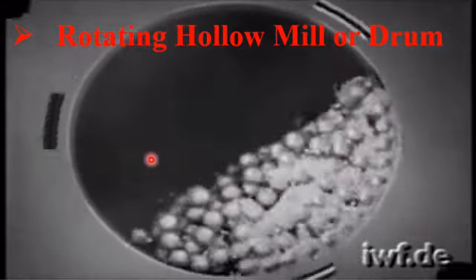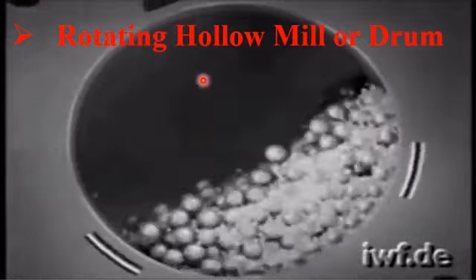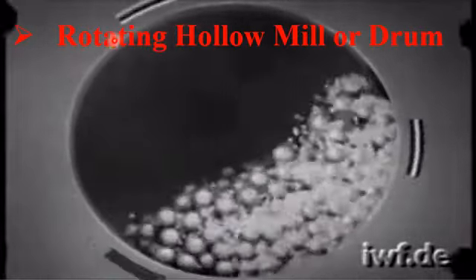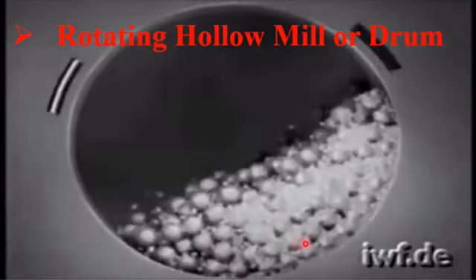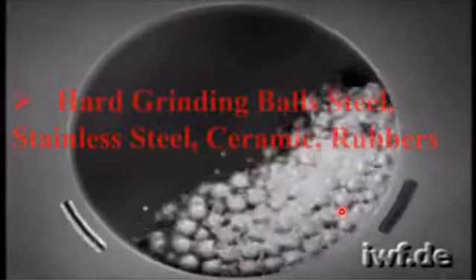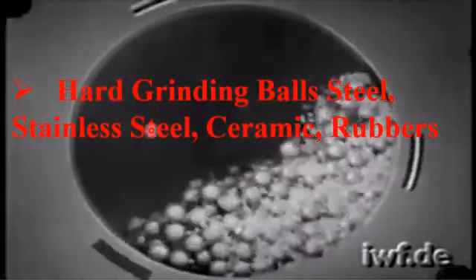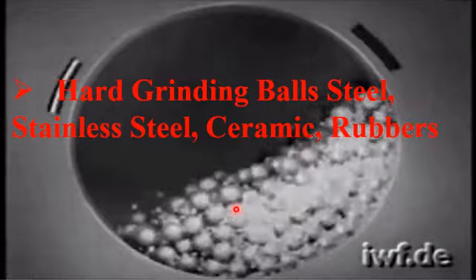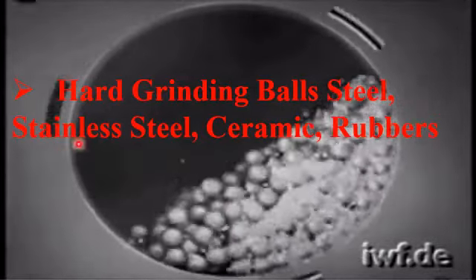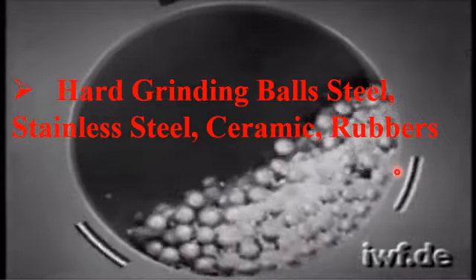This rotating hollow drum is partially filled with grinding balls, which are made of stainless steel, ceramics or rubber.